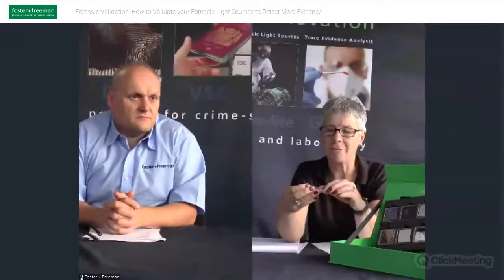This is a nice question on the back of that. Are there any recommendations for using the samples? For example, do you take the sample from the plastic box? Do you use disposable gloves? Some of the samples work really nicely by staying in the box, so you won't lose the fibers by keeping them within it, but you'll still be able to see the fluorescent fibers. You can take it out of the box and the fibers are sealed within a plastic coating.